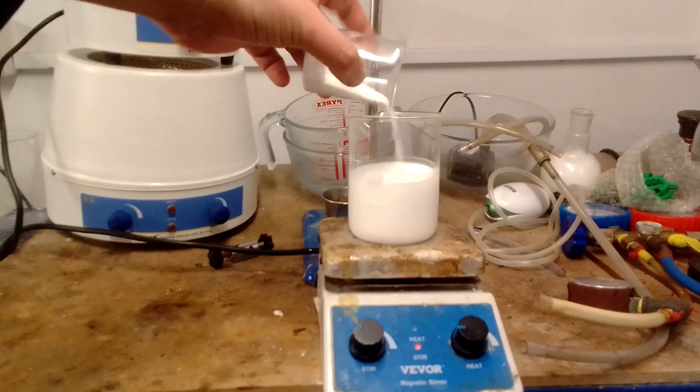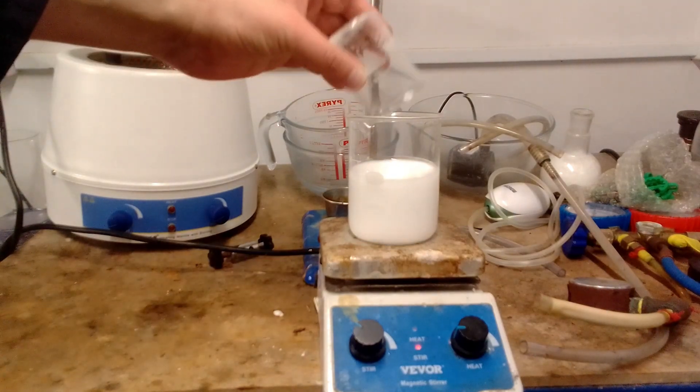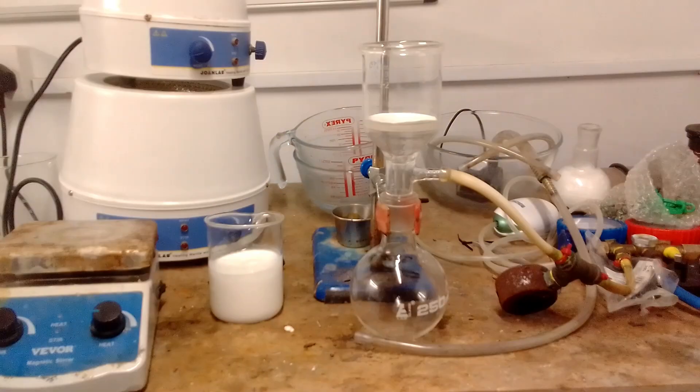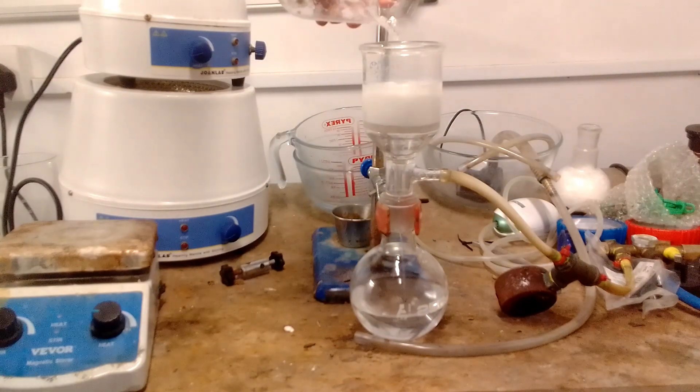The solution was transferred to a beaker because this made it easier to filter at the next step. Potassium carbonate was added, causing the isocyanurate in solution to precipitate out as a huge mass of fine white powder. This was removed by vacuum filtration.